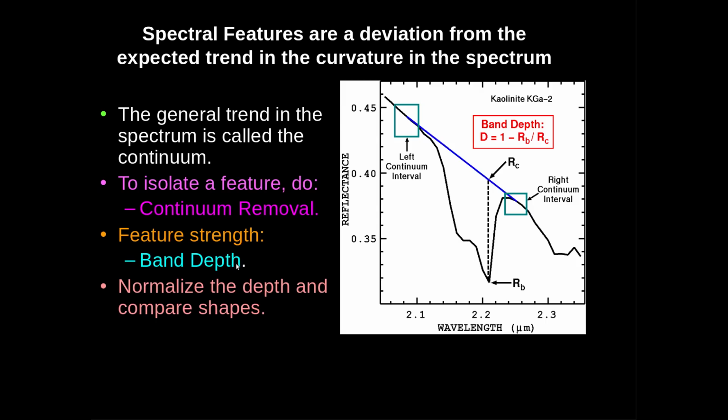So with Tetracorder, we define 2 ranges for a linear continuum and 2 more, one out here and one down here, if we want to do a curved continuum, and then a cubic spline is fit to the 4 points to do a curved continuum.